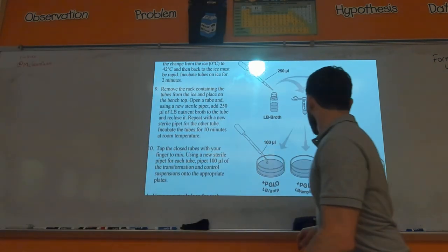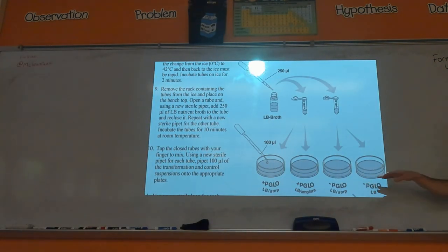Okay, so here's your basic setup and for the pGLO thing you really need to understand what's happening here and why.